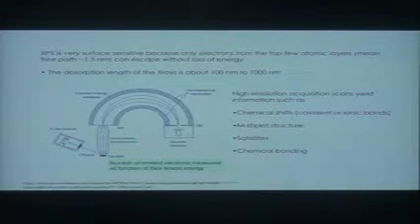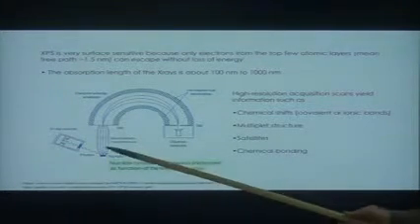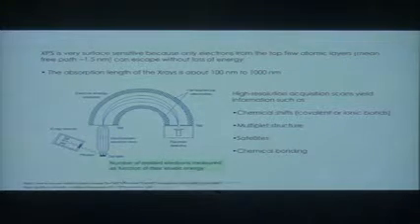So let's look at that energy analyzer. You have your sample, an X-ray source strikes the surface. Again, we have to use some electron optics, some electron focusing techniques. You have this semicircular entity on top. It's actually semi-spherical.